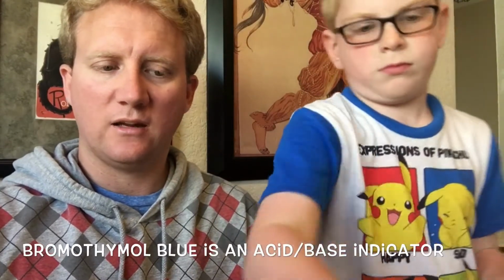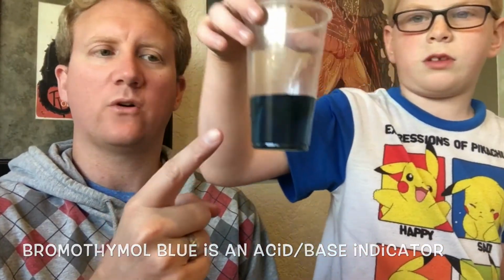I've also got the bromothymol blue solution, and it's an indicator. We poured it into our cup. This is a little bit of indicator and a little bit of water.